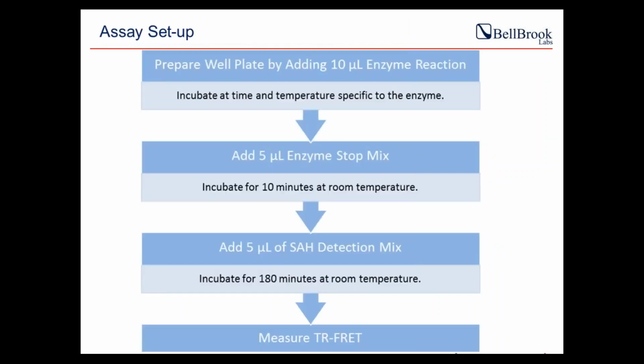So this flowchart walks you through the assay setup. You start, as I said, with your 10 microliter enzyme reaction. Of course, there's flexibility. If you want to make it even more sensitive, you can incubate a 15 microliter enzyme reaction. We leave it completely to the choice of the investigator to formulate the experiment as they choose, but this is how we suggest you do it in the tech manual.